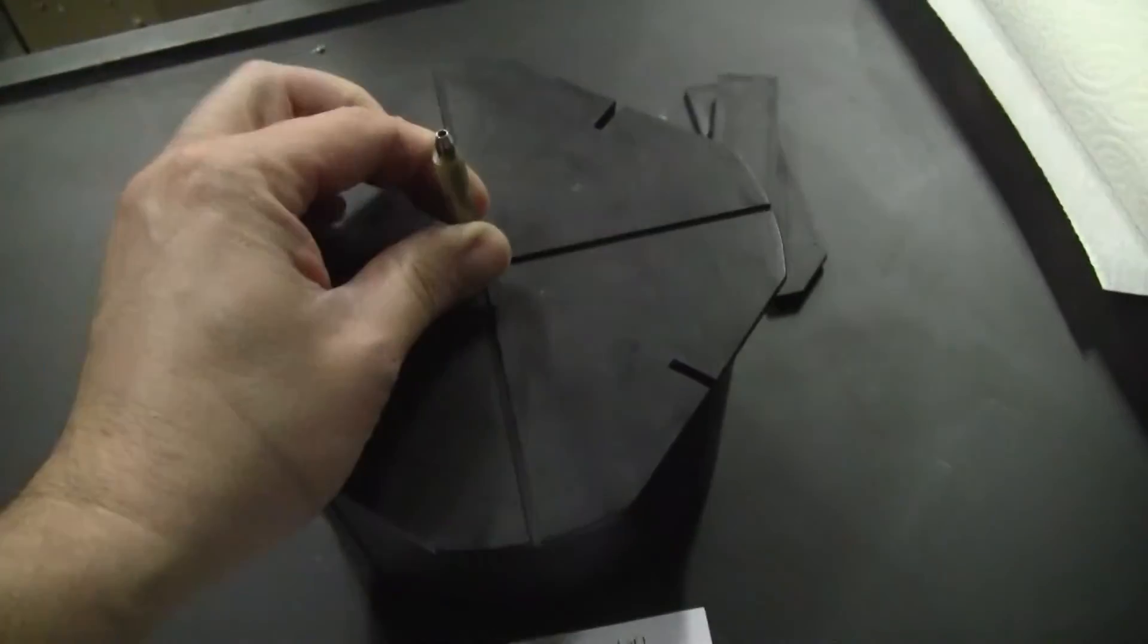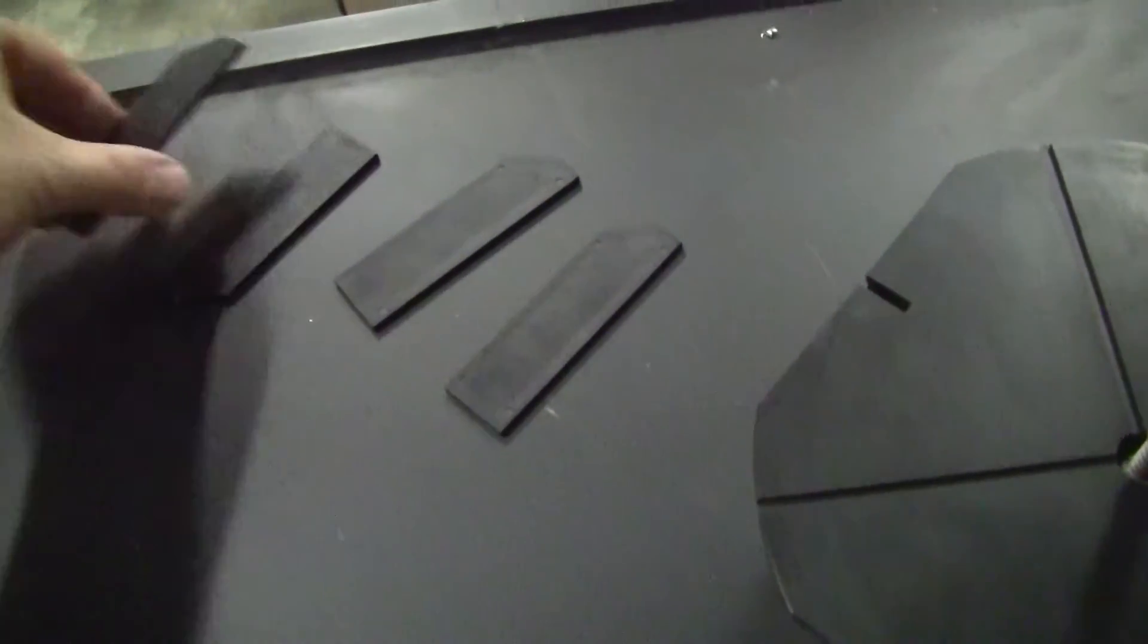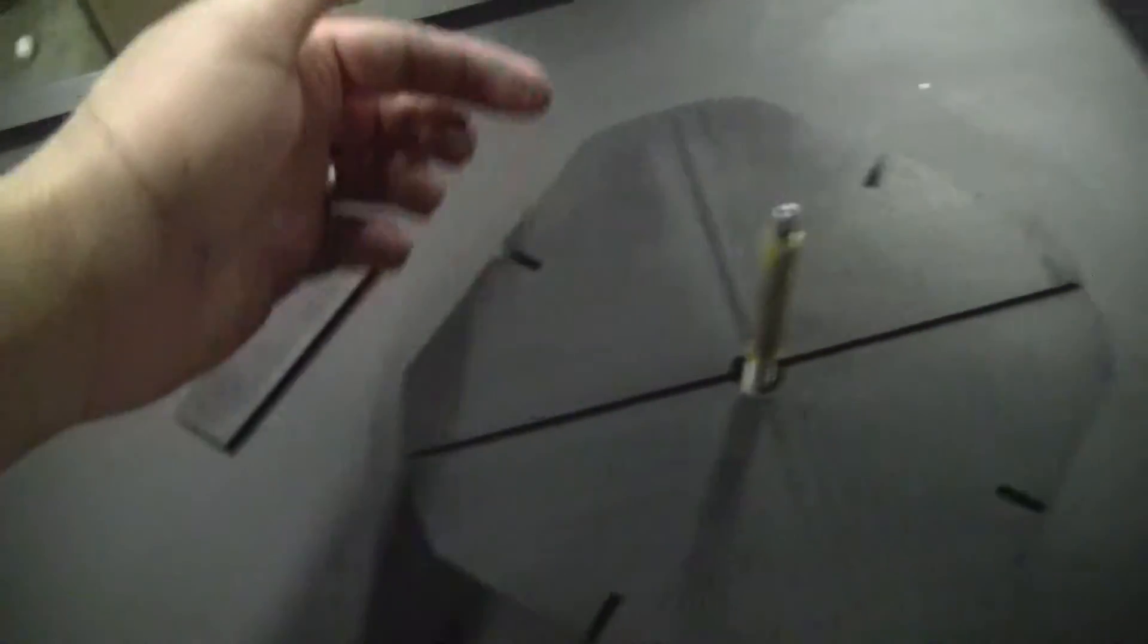Centerpiece, which I'm assuming goes in like that when it's all set. Look like baffles on the side. You've got four of them that slide into the slots.